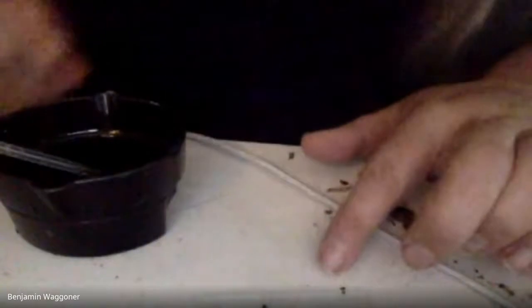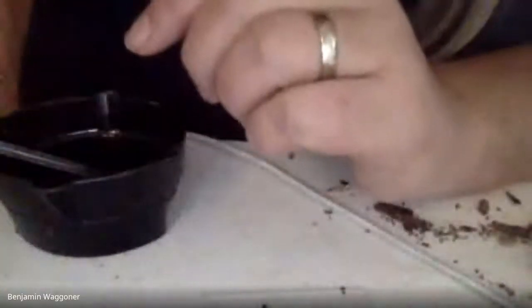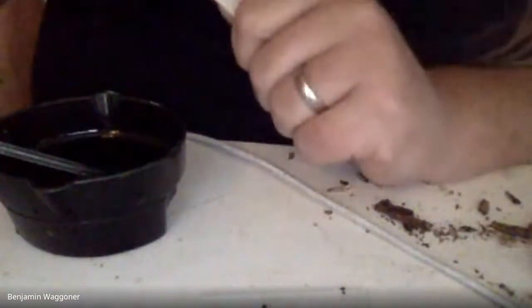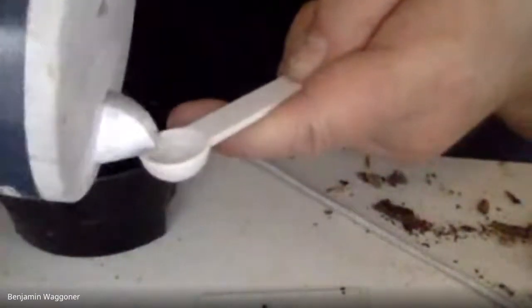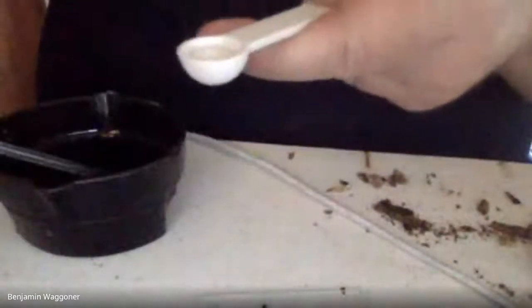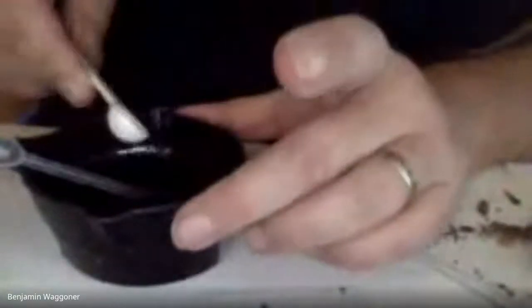things on the counter. Fortunately, the gut's still there. So we want to add a little saline. And the saline that we'd ideally have would have a number of salts in it, magnesium and potassium, as well as sodium and chlorine. What hopefully will do for our purposes is a 1/4 teaspoon of table salt in 1 cup of water. But I have to cut the salt in half because the cat drank half the water. So I have about 1/2 cup of water. So I'm putting in about 1/8 of a teaspoon of salt, and I'm going to put in the tiniest pinch of baking soda. That should do.